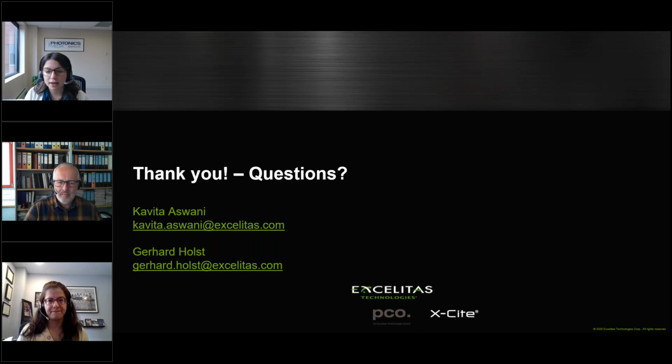The first question I have is, do I need special objectives to apply the camera in the SWIR spectral range? I guess that's on my side for the cameras. And yes and no. Certainly you need specific objectives in microscopes or C-mount objectives that are properly corrected for that spectral range.